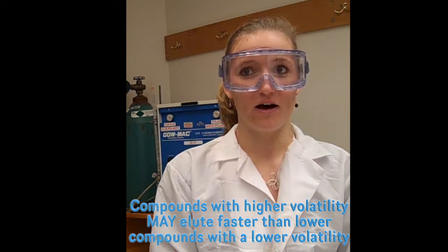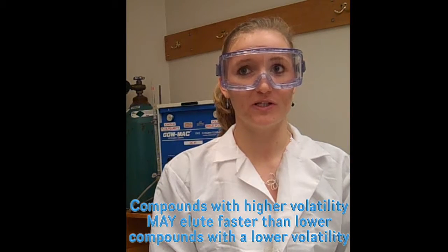There are a number of factors that affect retention time of compounds. For example, the more volatile a compound, the faster it will elute due to its lower boiling point. In fact, compounds must have boiling points below 150 degrees Celsius in order to be separated by the GC.